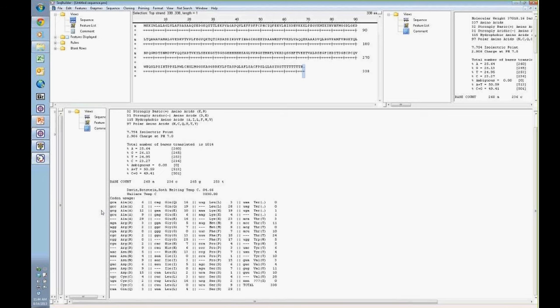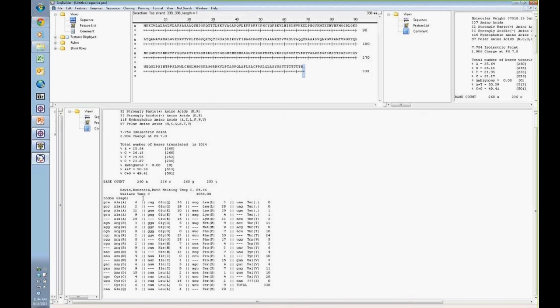So for those of you who are not that familiar, rare codons are basically lower frequency codons that exist in different organisms. For example, since we express this in E. coli, some common arginine rare codons would be AGG, AGA, leucine would be CUA, proline, CCC. So simply looking at this, I have some arginines here where there are some rare codons present. So there's 3 here, 2 here.